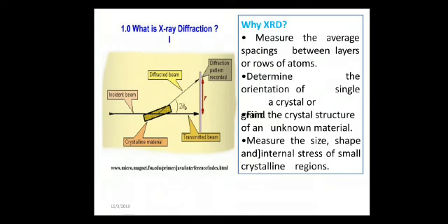And the next is determining the modal amount of minerals, that is quantity analysis, and determining the thickness, roughness and density of a film using glancing incidence X-ray reflectivity measurements. Measuring residual stresses in bulk material and ceramics.